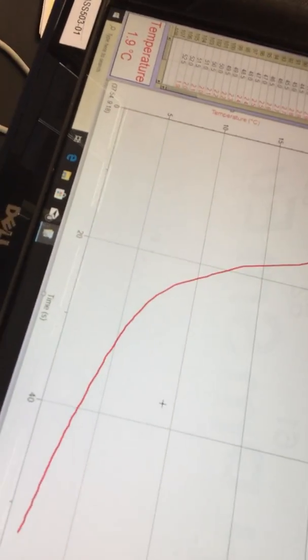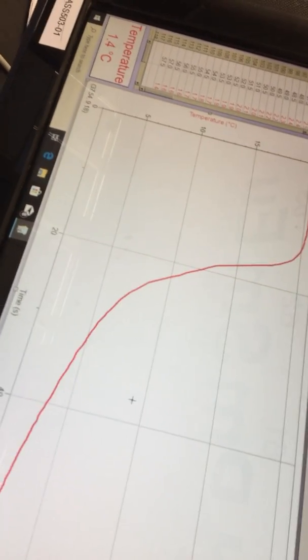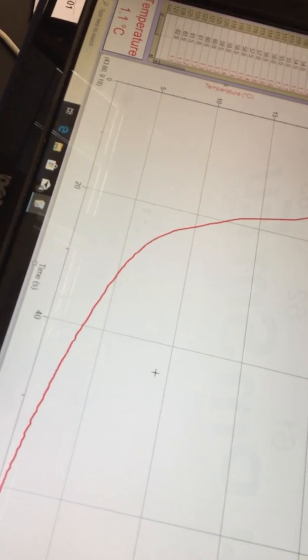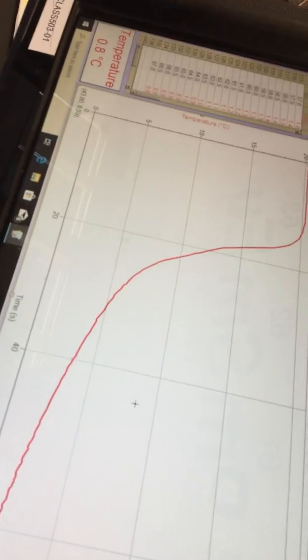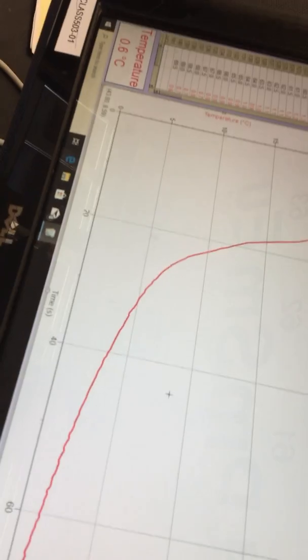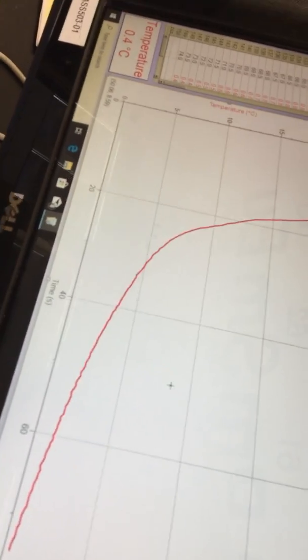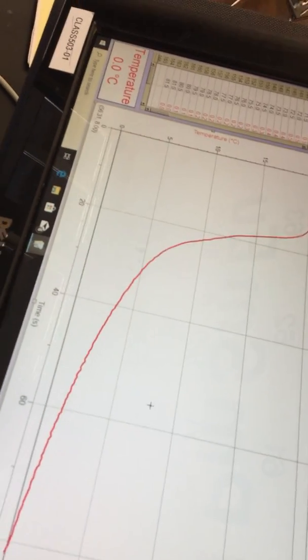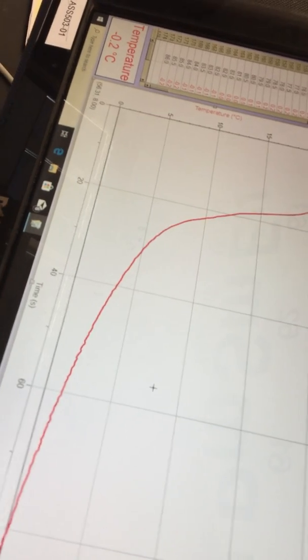So take a look at the temperature. Temperature is less than 2 degrees. So 1.7, 1.4, 1.5. Eventually it'll flatline down at the bottom, and we'll get those temperatures. What's interesting is this is citric acid and baking soda. This is just Alka-Seltzer. So having Alka-Seltzer in water is going to drop the temperature. Wow, we're below freezing. Well, of pure water.